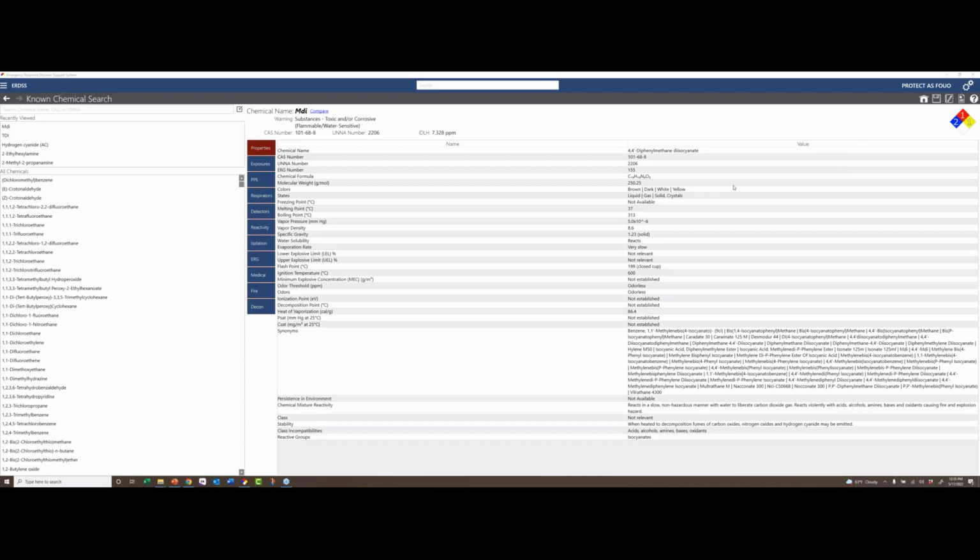Yeah, so Noel, in terms of using KI paper, all kinds of false negatives, especially in the laboratory. So we very rarely, activating it with HCl definitely will give you a better result, but it's not operationally always capable in the field.